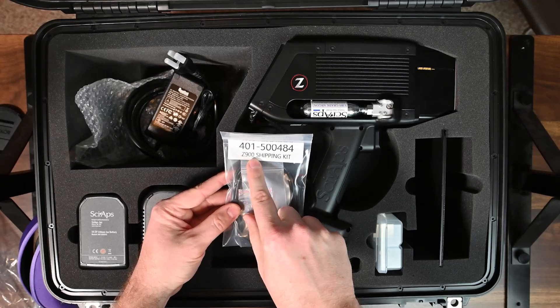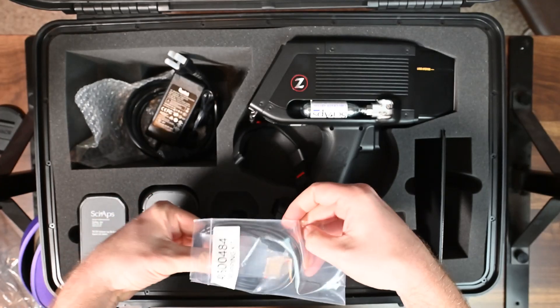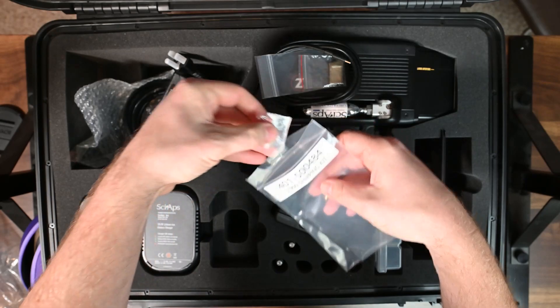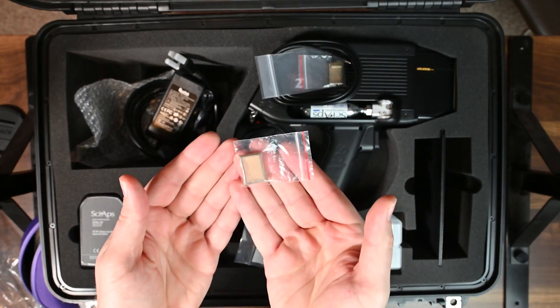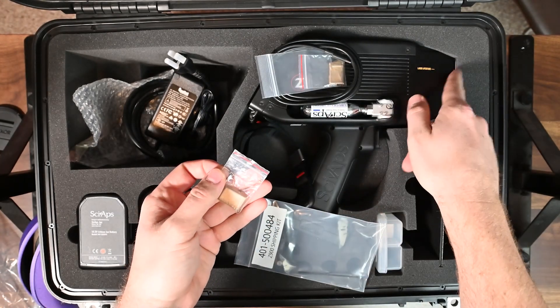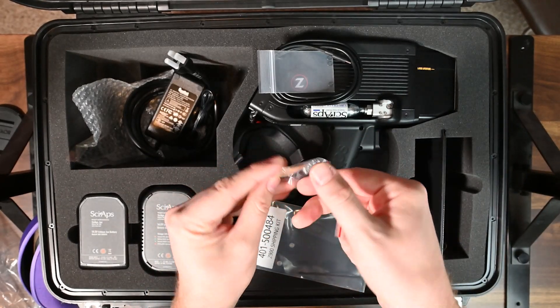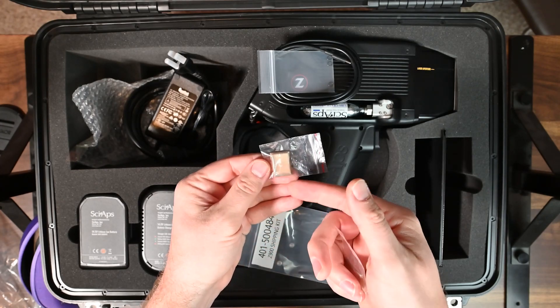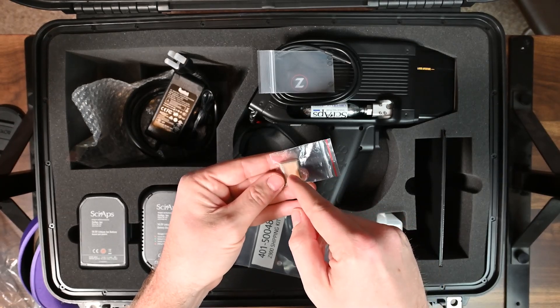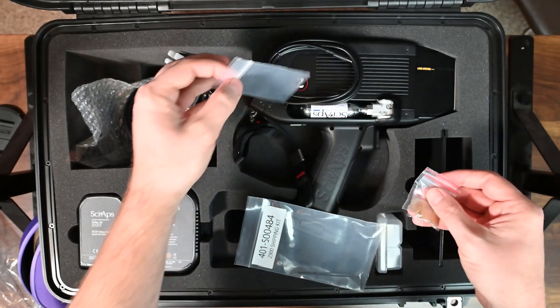We have what's called the Z900 shipping kit — a little bag of spare parts and accessories. First, we have a blast shield, also called a splatter shield. These go in the front of that faceplate. The laser actually doesn't hit the center of the splatter shield, so if you have a dirty one or one that's not working well, your readings won't be good. But if you flip it over the long way like this, you can get some more life out of it — a quick tip from the LA geek.